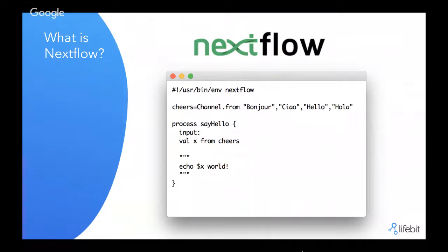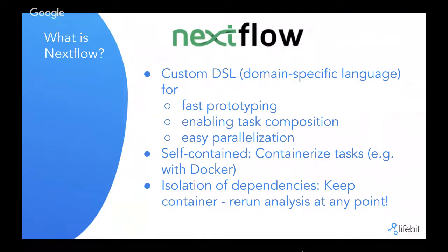And yeah, that's a really useful benefit of using Nextflow. So Nextflow is a domain-specific language, specifically used for bioinformatic analysis. Some of the benefits are fast prototyping. You can get a pipeline up and running really quickly, and especially do much more complex analysis than you'd be able to with Bash scripts, for example. While you would be able to do it, I'm sure it would be a lot more difficult and a lot more time consuming.